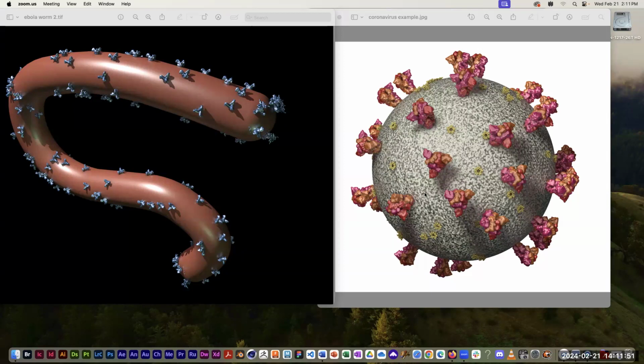So you take cryo-electron micrographs, which are individual cross-sectional slices, and then you stack them together to create a three-dimensional image. Very similar to the way Horos takes a bunch of cross-sectional slices from CT or MRI, stacks them up to make a 3D model. Cryo-ET, cryo-electron tomography, takes individual cross-sectional electron microscope images and stacks them up to create something 3D.